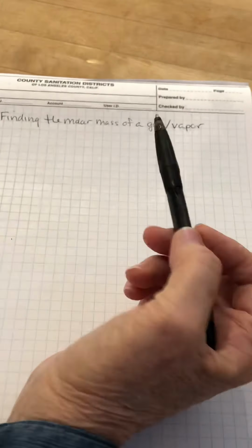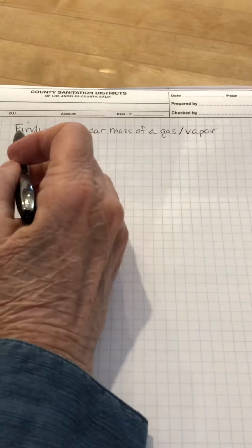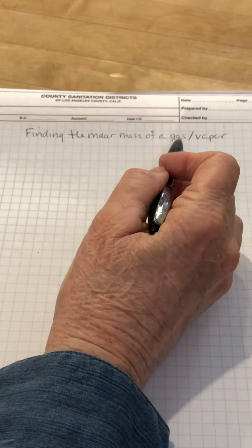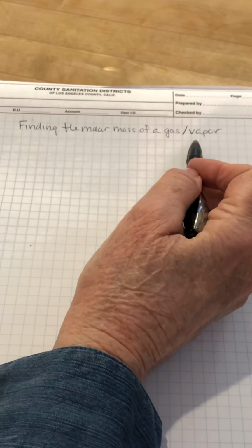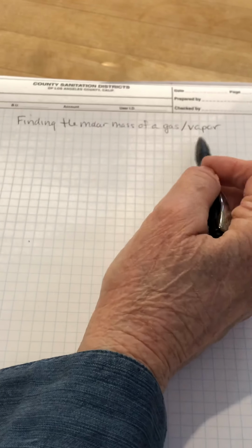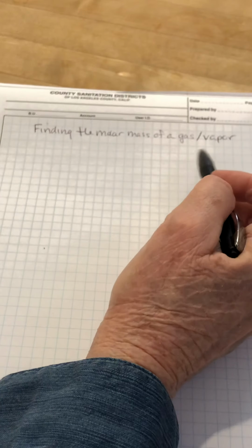Something that's not discussed too frequently in your book, in fact, I'm not sure it's there at all, but it is a lab we would be doing, is finding the molar mass of a gas, or technically a vapor, because you'd be starting with a substance which is a liquid at room temperature, but becomes a vapor at less than 100 degrees Celsius.